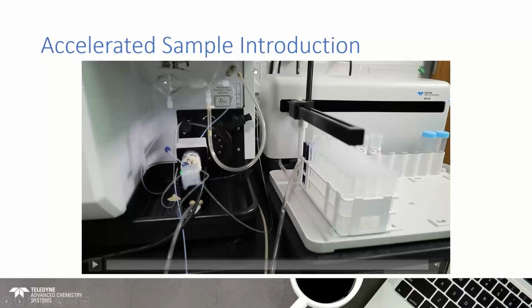This is our ASX 560 auto sampler with 4 racks. And you'll just see at the back end of the rack, next to the rinse station, there's a couple of dark blue samples there. Over here on the left-hand side, towards the top of the screen, you'll see there's glassware for our ICP, and then under it, we've got our valve pump module for our ASXpress system.